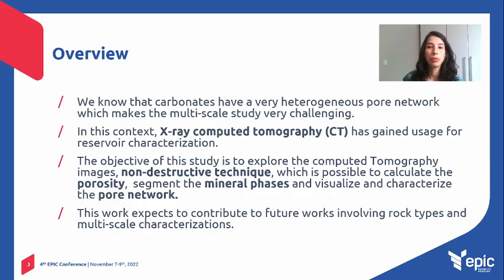We know that carbonates have a very heterogeneous pore network, which makes the multi-scale study very challenging. In this context, the X-ray computer tomography has gained usage for reservoir characterization. The objective of these studies is to explore the computer tomography images, that is a non-destructive technique, which is possible to calculate the porosity, segment the mineral phases, and also visualize and characterize the pore network.